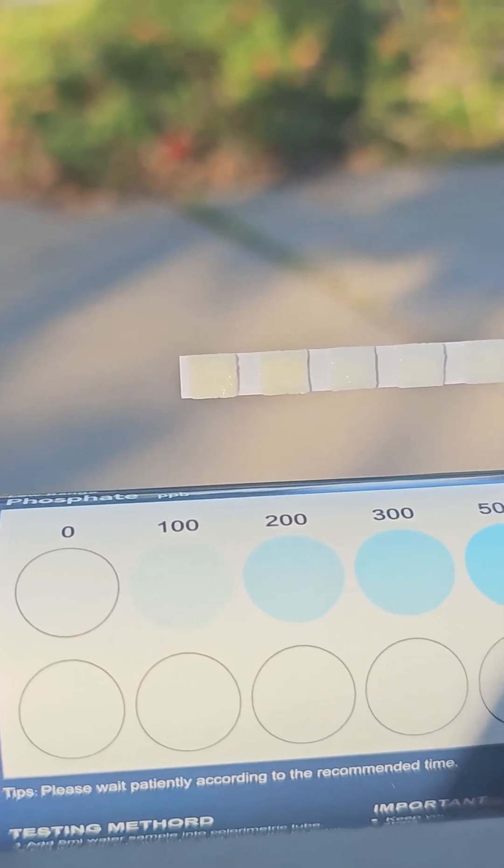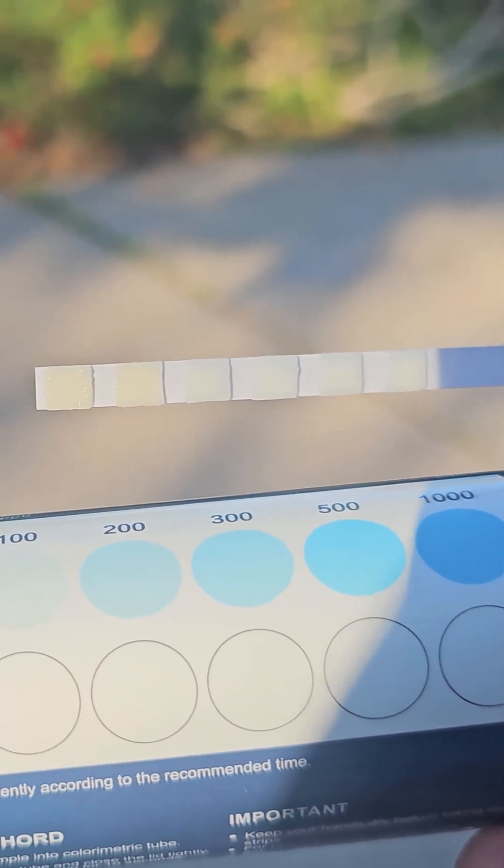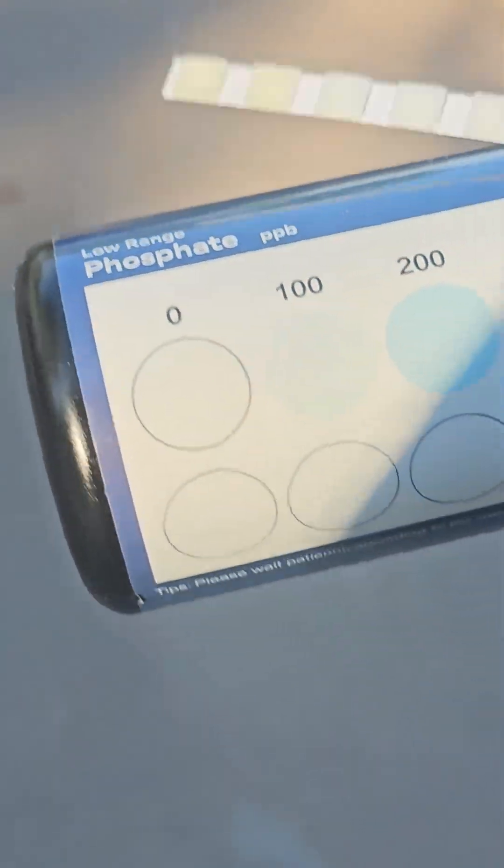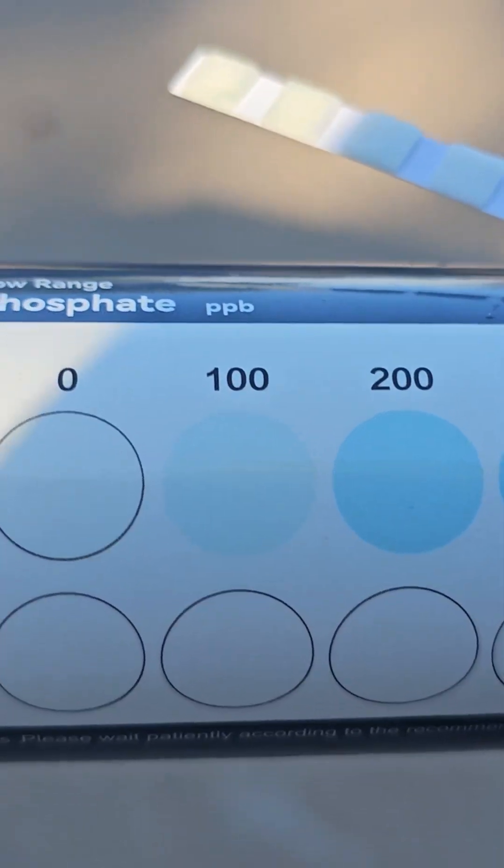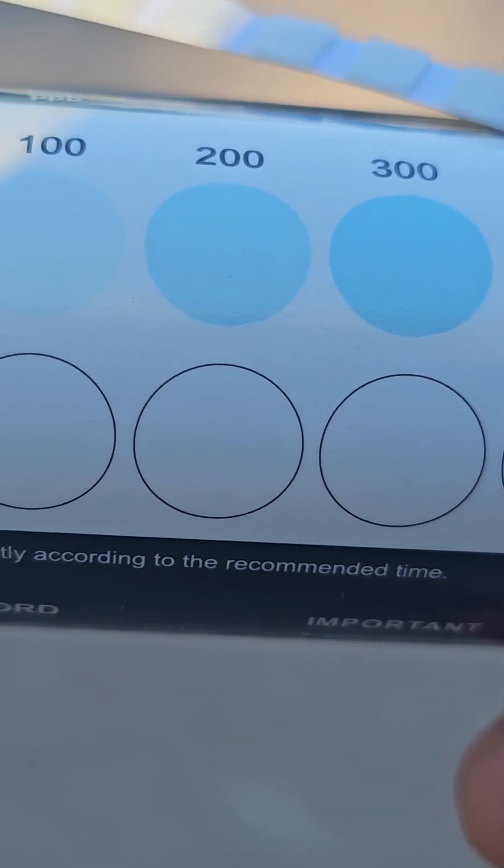As you can see, we are comparing it and it looks like they're all in the hundred. It does have a chemical imbalance, but that's where you could come in and set up your own chemicals. It shows us that it's a little bit imbalanced, we're in the 100.